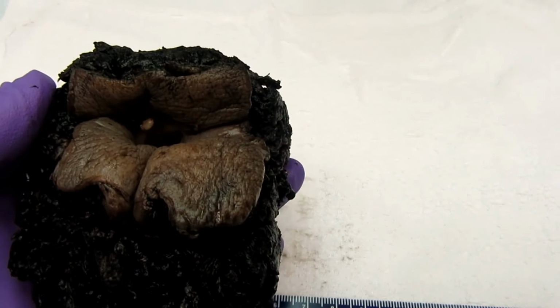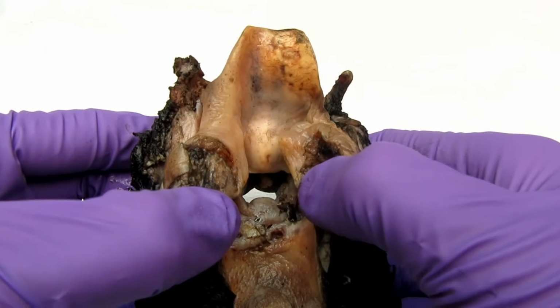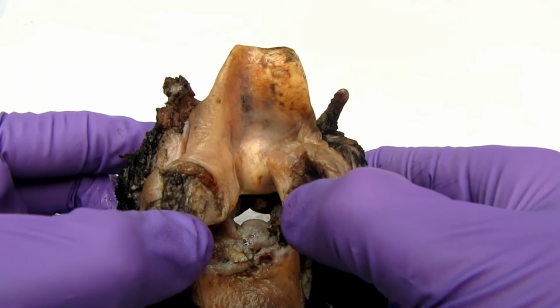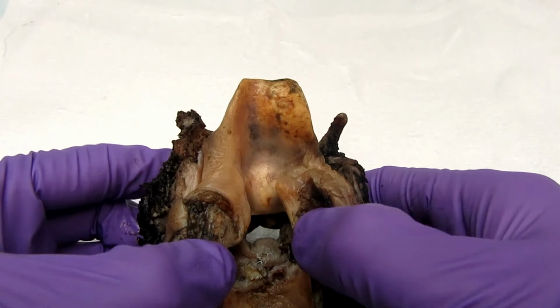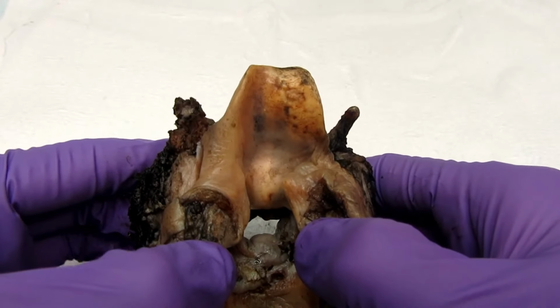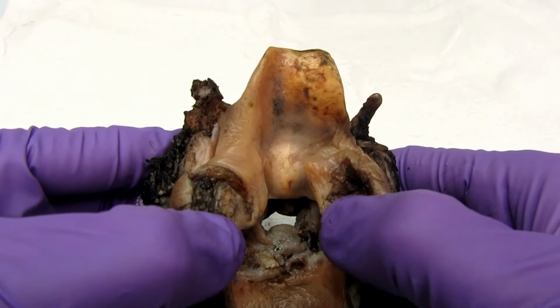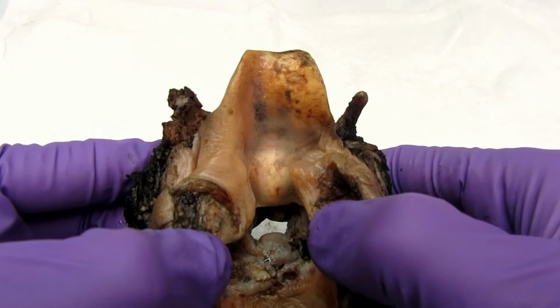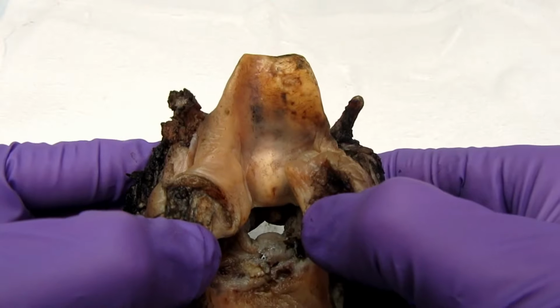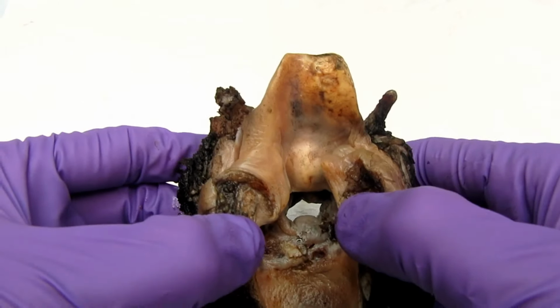Once we take our margins and suction through the tumor, we should be able to get a better idea of the extent of invasion of the tumor, which is critical in our tumor description. We need to describe whether the tumor is supraglottic, glottic, or subglottic, whether it crosses the midline, and whether it involves any of the structures we previously mentioned. It's also very important that we document any tumor extension into the thyroid cartilage, strap muscles, tongue, thyroid, or esophagus. So at this point, we would say that our lesion is transglottic, crosses the midline, and erodes through the thyroid cartilage.